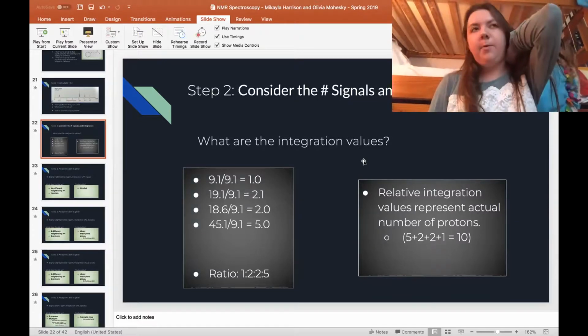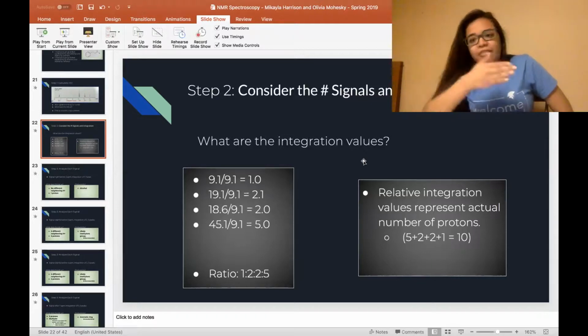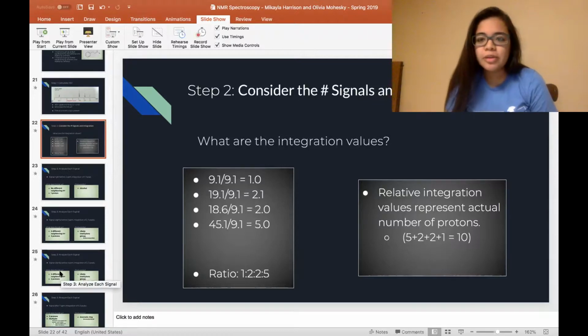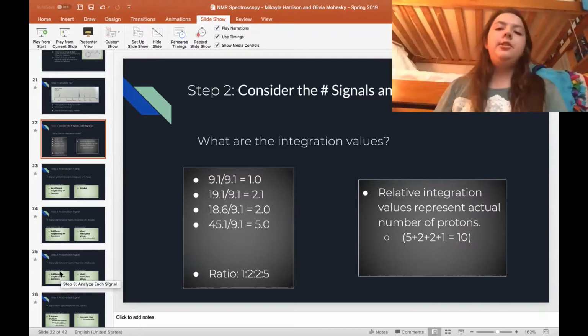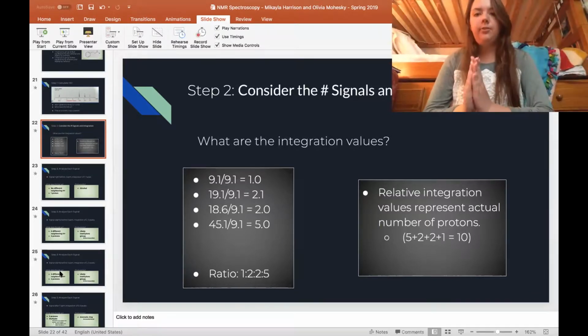You're not going to get 1.5 hydrogens as one of your integral values. Right. After you multiply them, because I think the first option was to multiply by 2, right? Yeah. Especially when you get 1.5 as a result. Sometimes it'll be 2, sometimes it'll be 3, sometimes you multiply it by some other value. It really just depends on whatever gets you integer values, not integral.